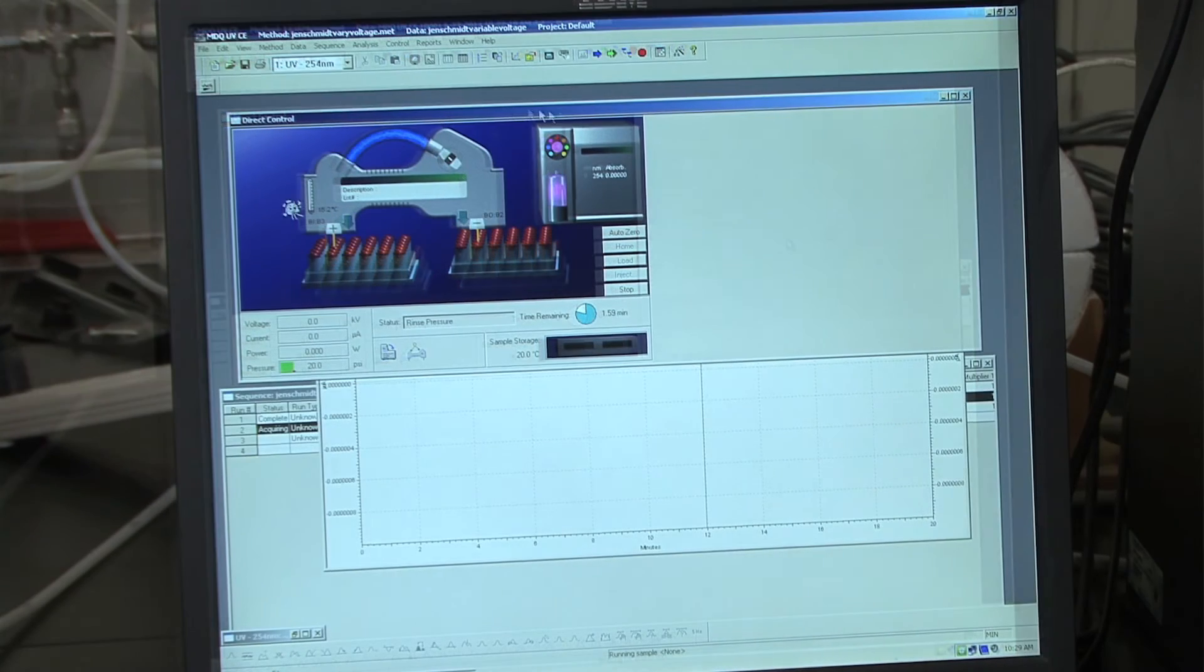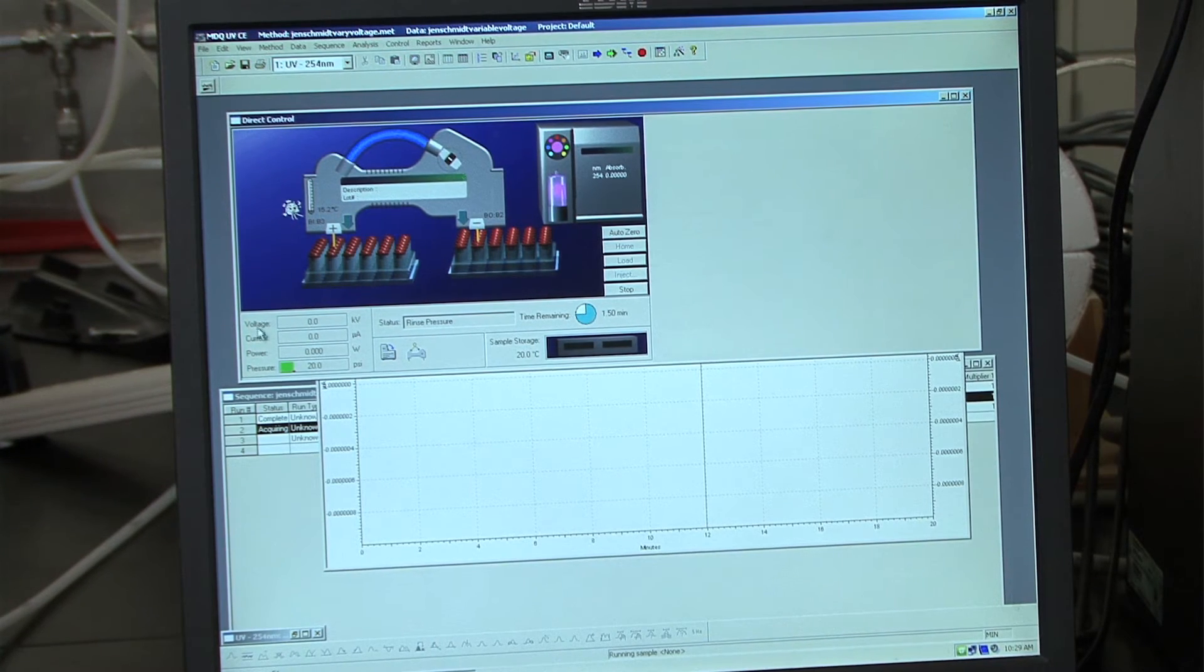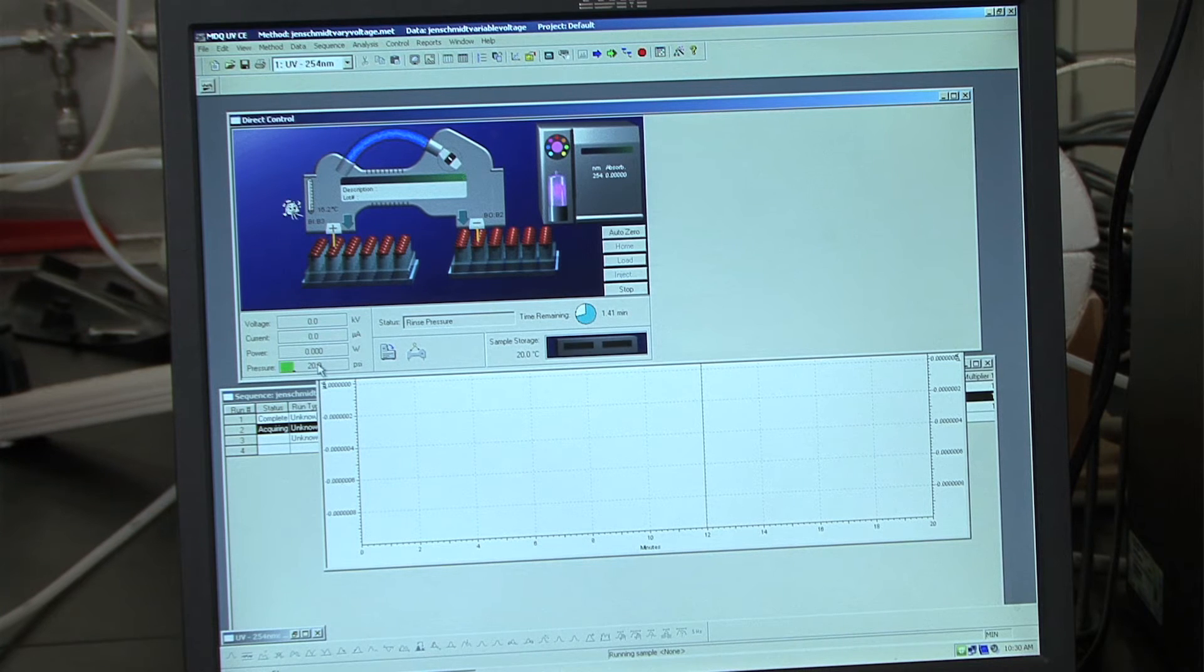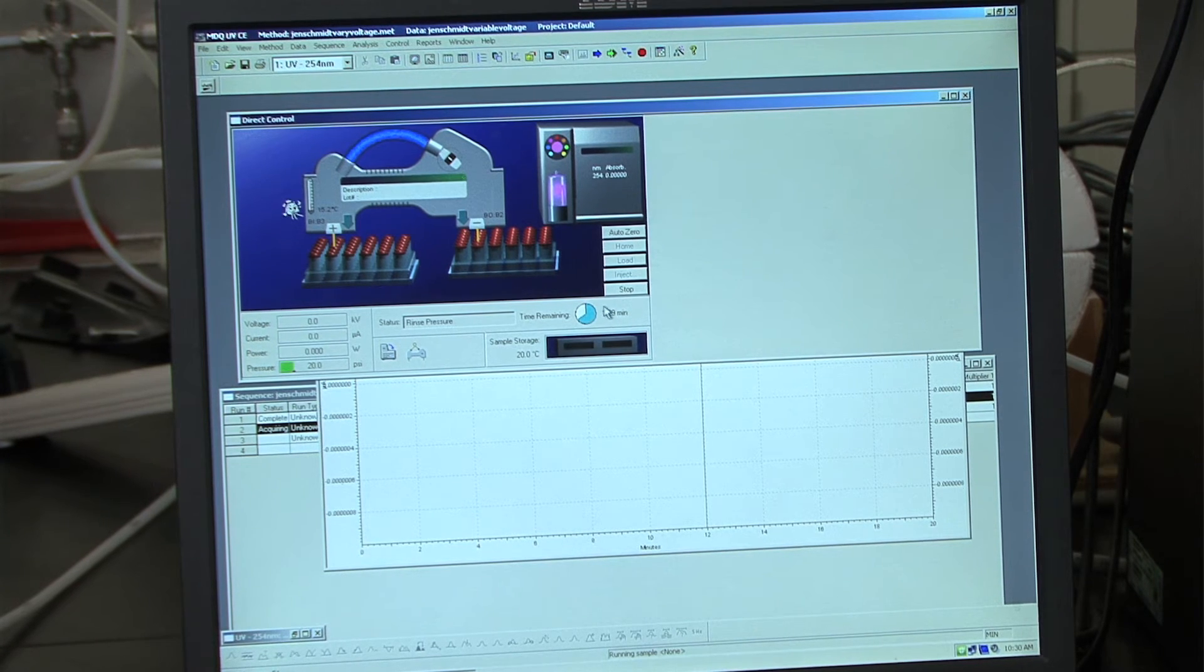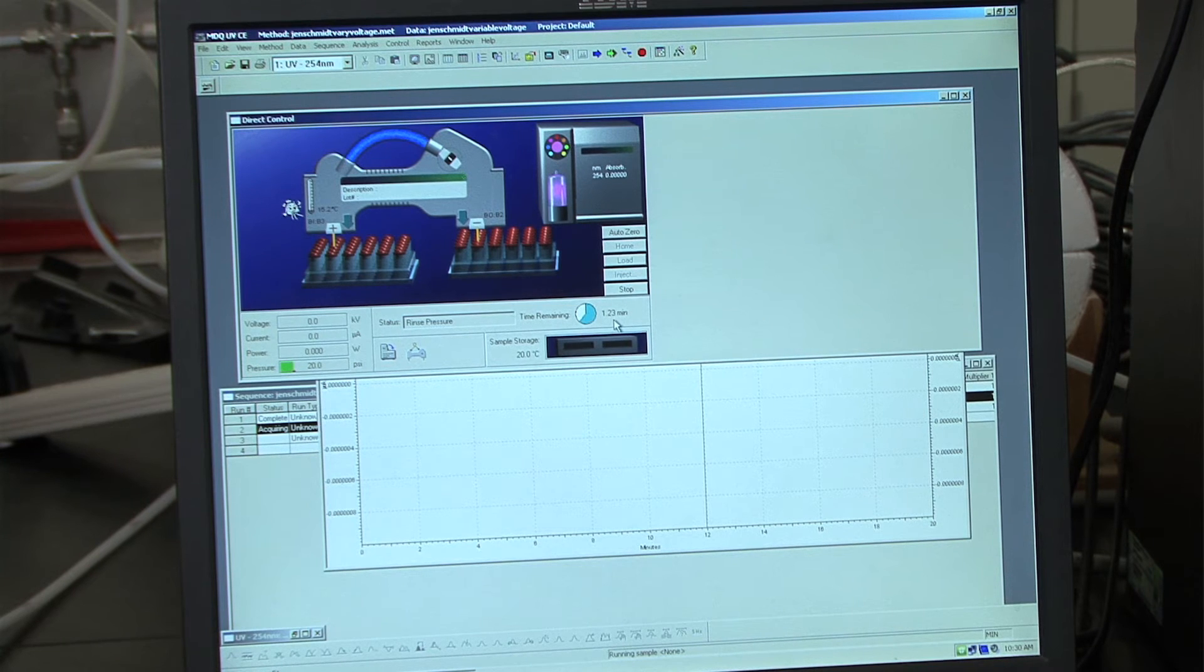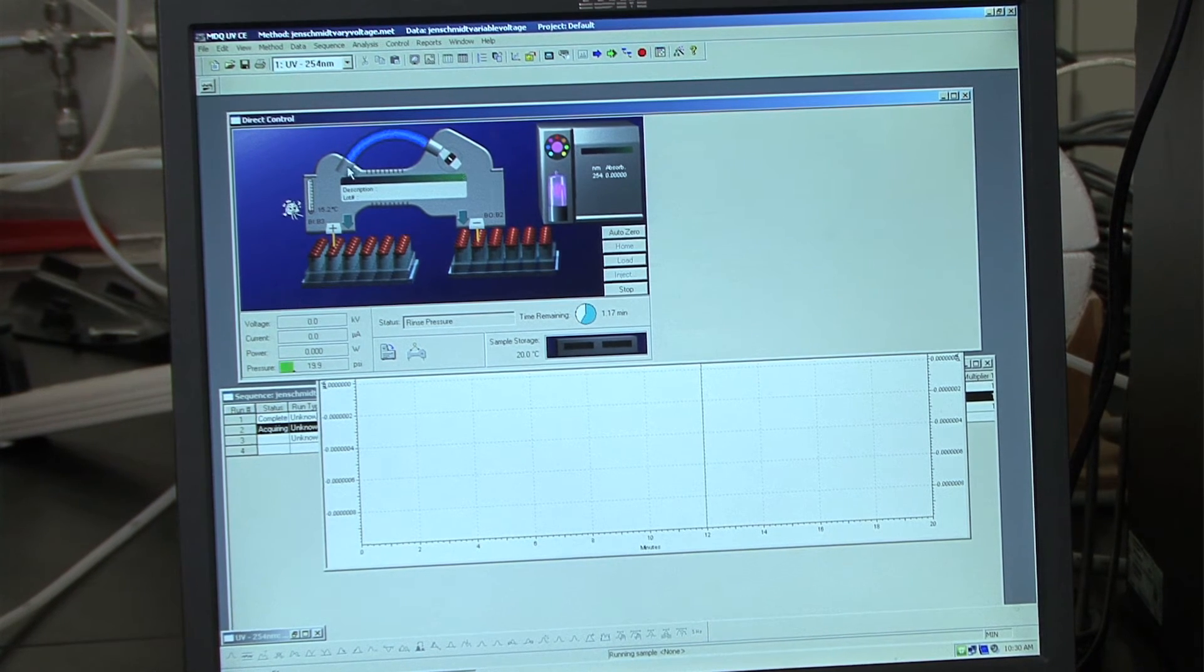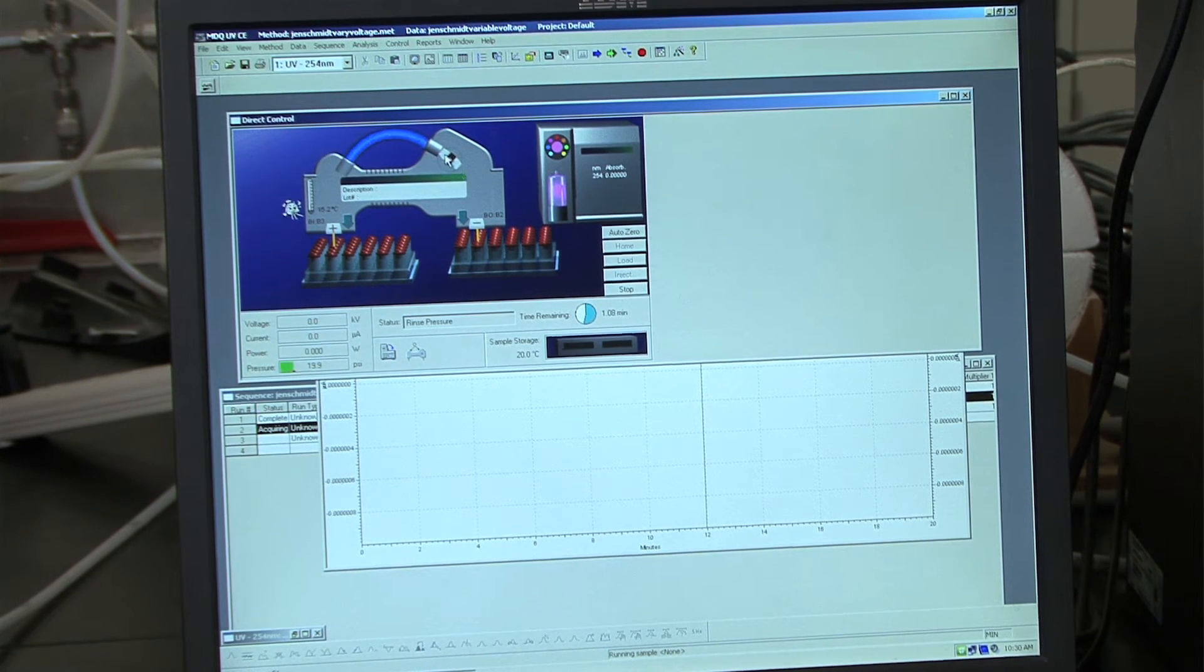So in the direct control window, there are a few things to note. The first is the pressure down here. And you want to make sure that when it maintains a constant pressure of around 20 psi. Another thing to notice is this time remaining pie chart here. And this shows you the time that is remaining for that specific sample injection. You can also follow along up here and see when the sample is being injected into the capillary.